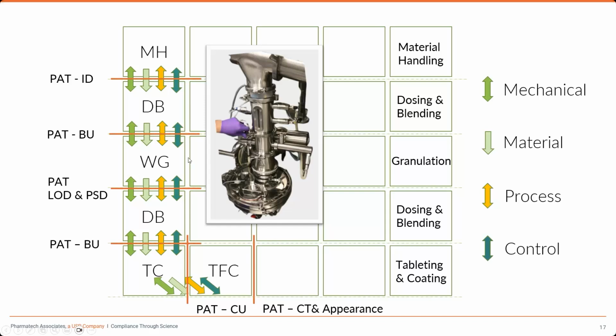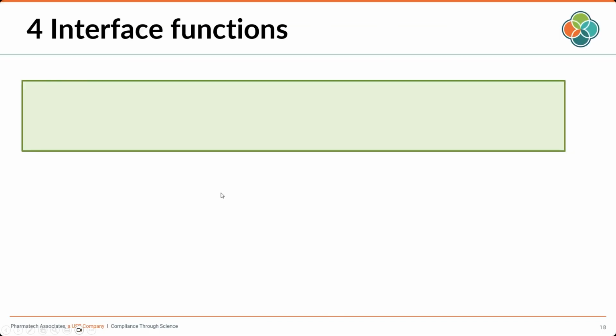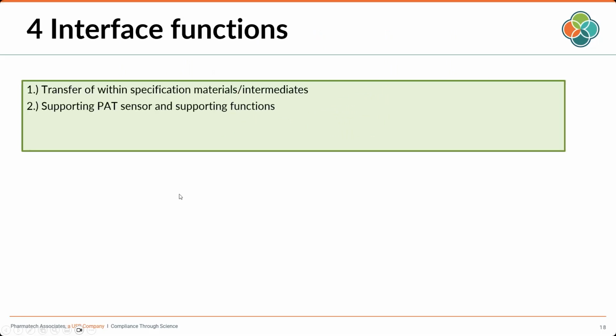So what I'm advocating for is saying, okay, you have to tailor make this. Of course, you have new designs today which are more lean and possible to adapt in a process position. But I think it is also the question, is it really all needed all the time? In development, yes, no question, because you may also support PAT development of predictive models and so forth.